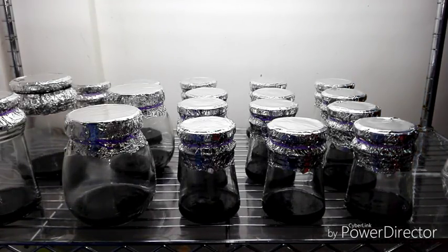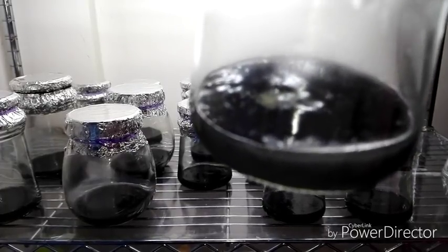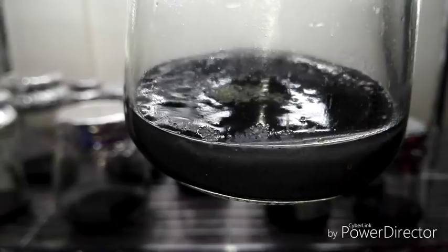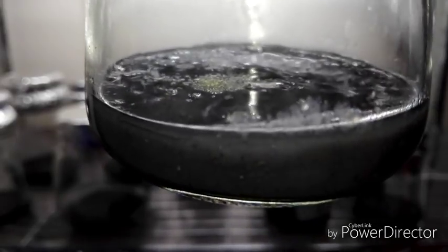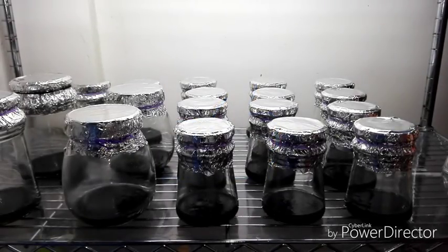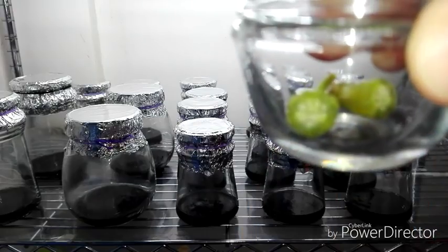Once you're finished, don't forget to put aluminum foil on the lid of the flask and also a rubber band to hold the aluminum foil in position. After sowing the seeds, you'll see the seeds are very visible on top of the agar. It will take about two to three weeks before you see the seeds transform into a protocorm. There's only a few seeds remaining inside the seed pad that didn't drop during the process.